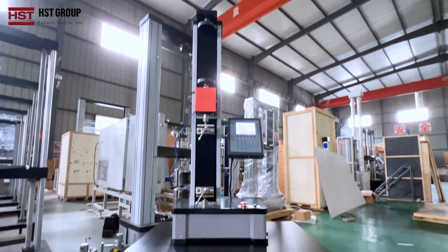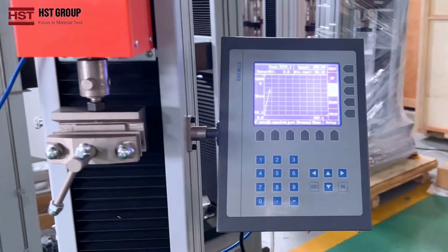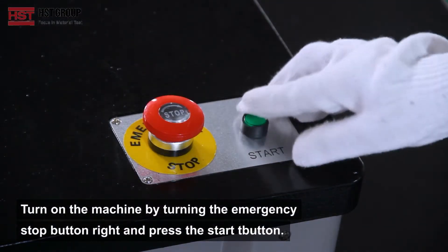Our company is the leading factor in China, supplying all kinds of testing machines. Today I'm going to show you how to use our single column universal testing machine. Turn on the machine by turning the emergency stop button right and press the start button.